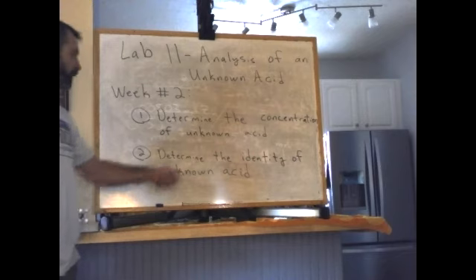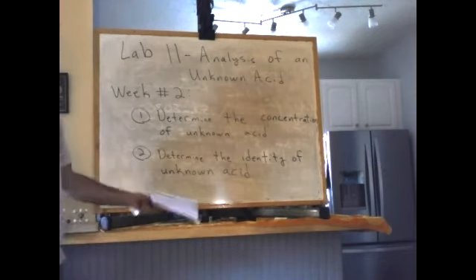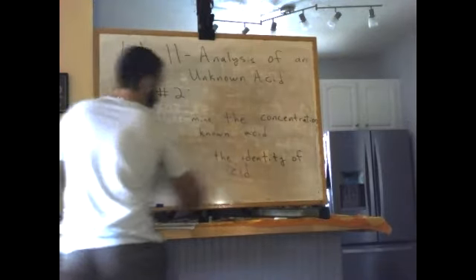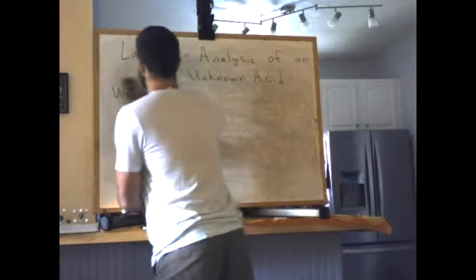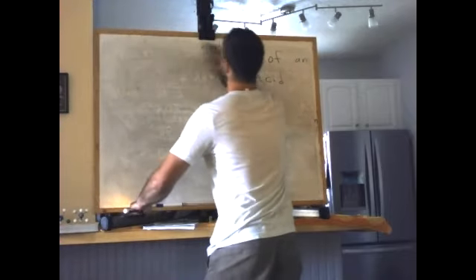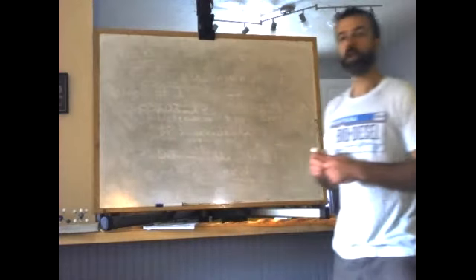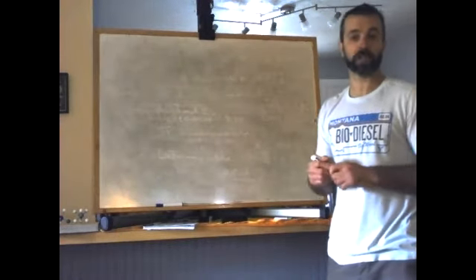Okay, how do we determine the identity? This is a little more complicated, so let's go ahead and talk about it. All right, so the whole point of week number 1 was to standardize our NaOH. What do we mean by standardize our NaOH? The whole goal of week 1 was to accurately determine the concentration of our sodium hydroxide.